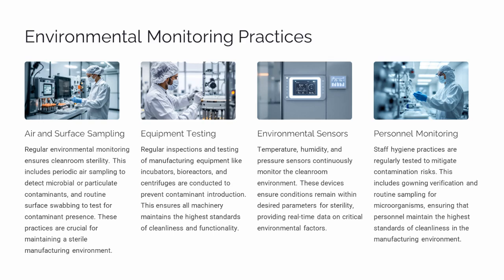Environmental monitoring practices are essential to ensure cleanroom sterility. This includes air and surface sampling, equipment testing, environmental sensors, and personnel monitoring. These practices help maintain the highest standards of cleanliness and functionality in the manufacturing environment.